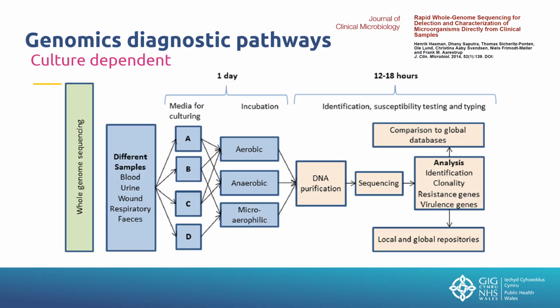You can have comparison with global databases and typing information available in a very short period of time.